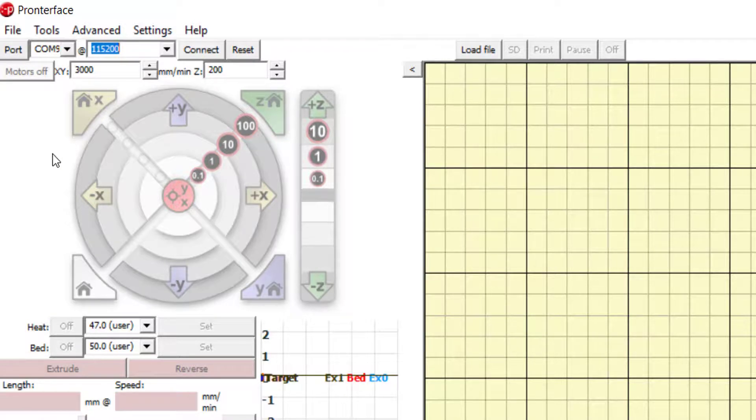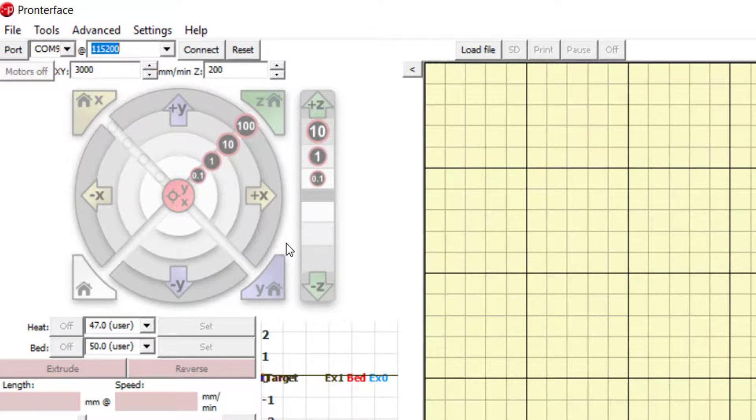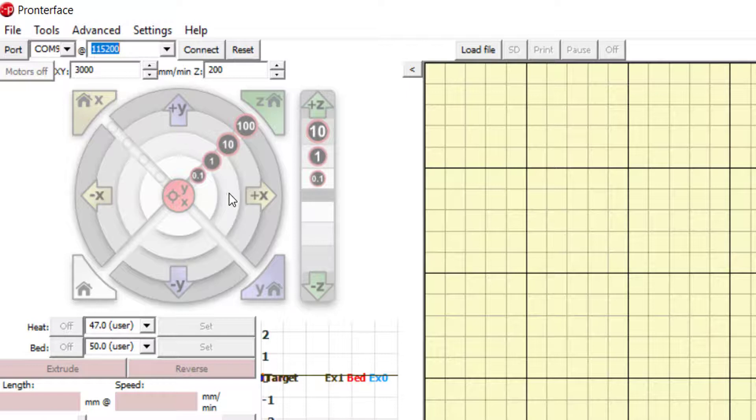Below is the control panel where you can manually move the bioprinter components. You can move the extruder head in the X direction using the buttons by 0.1, 1, 10, or 100 mm in the positive and negative X directions.